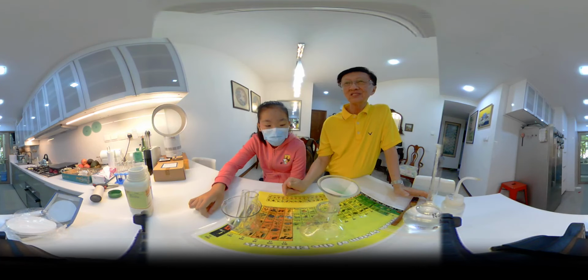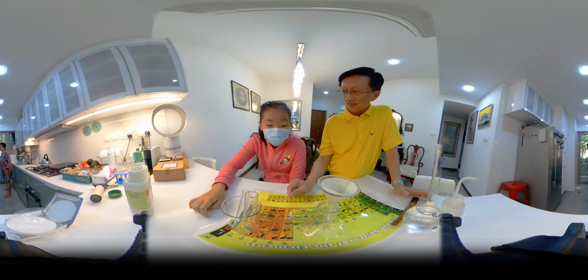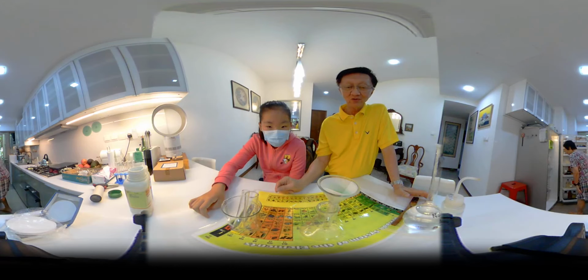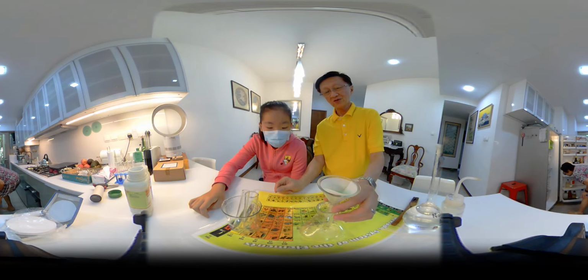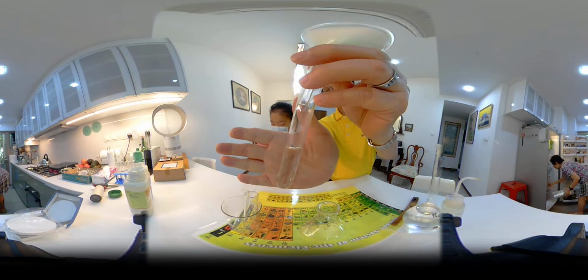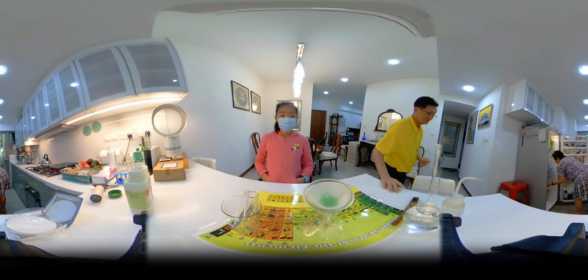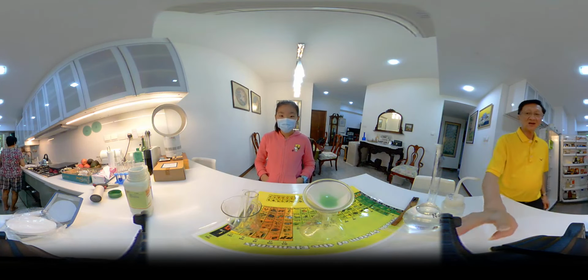And I think we have seen before in our redox reaction how a purple color can turn colorless. Can you remember that? If you can't remember, we will repeat that. There again you see, now is a colorless solution. Yeah, enough.